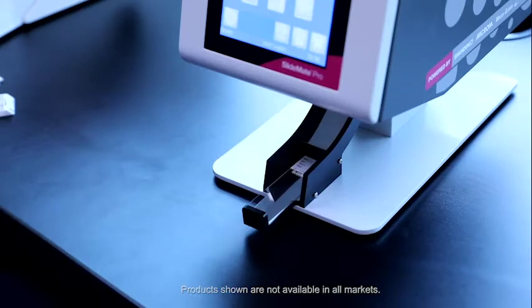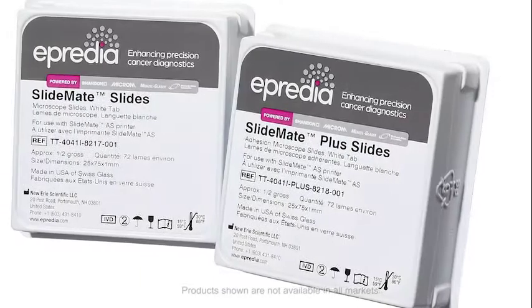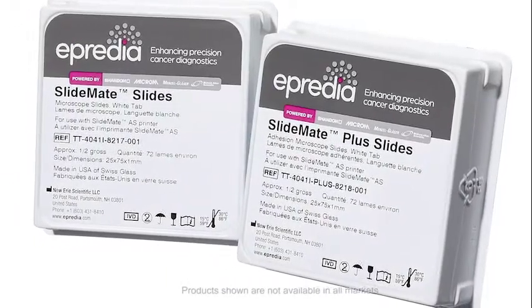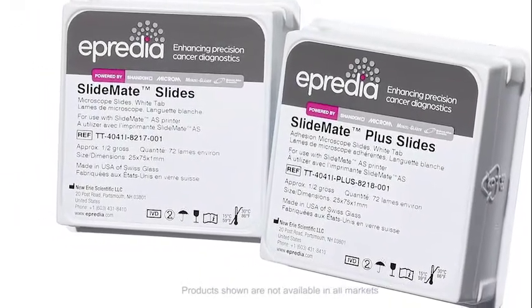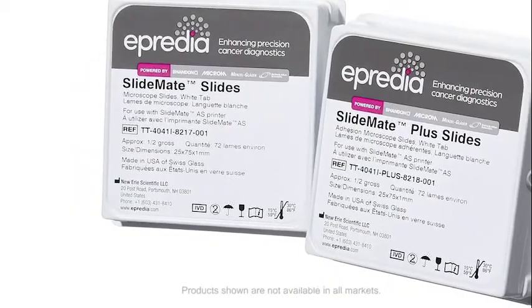The SlideMate Pro is an open system allowing for printing on a wide variety of slides. For optimal results, we recommend the new Ipridia SlideMate Microscope slides.